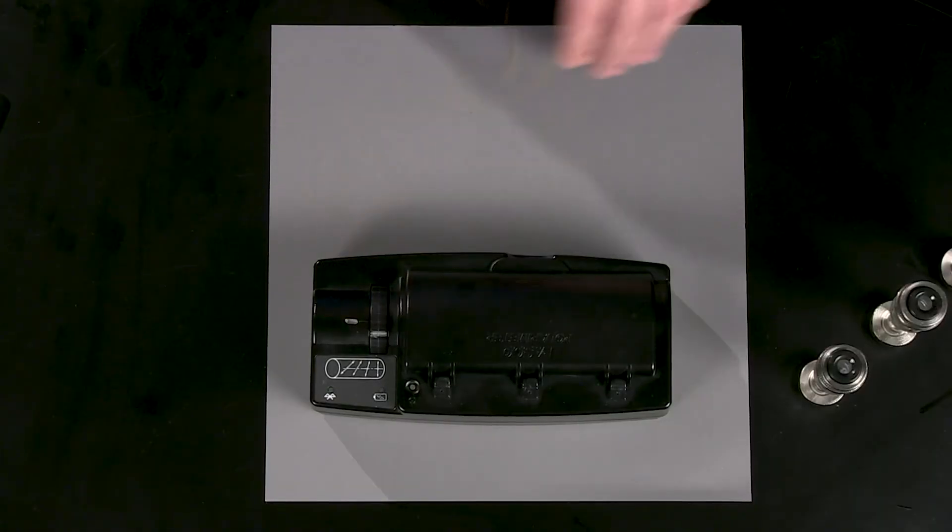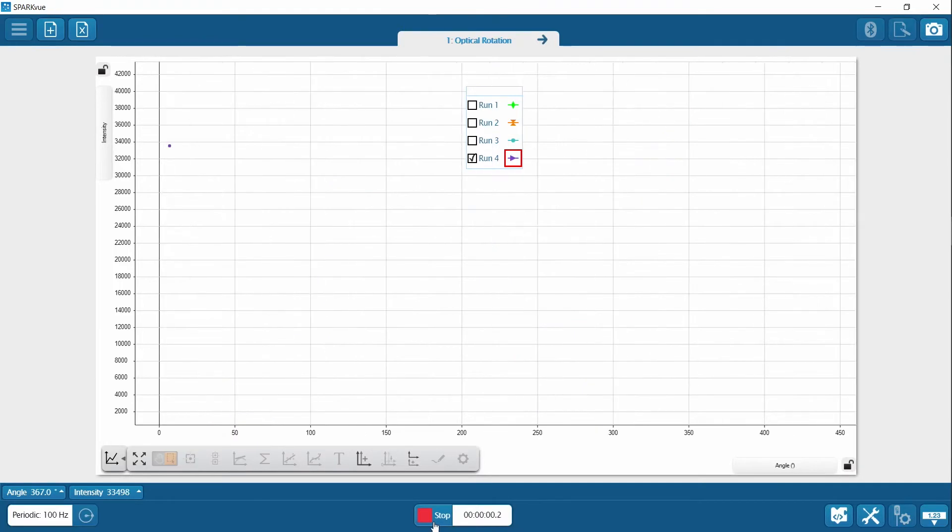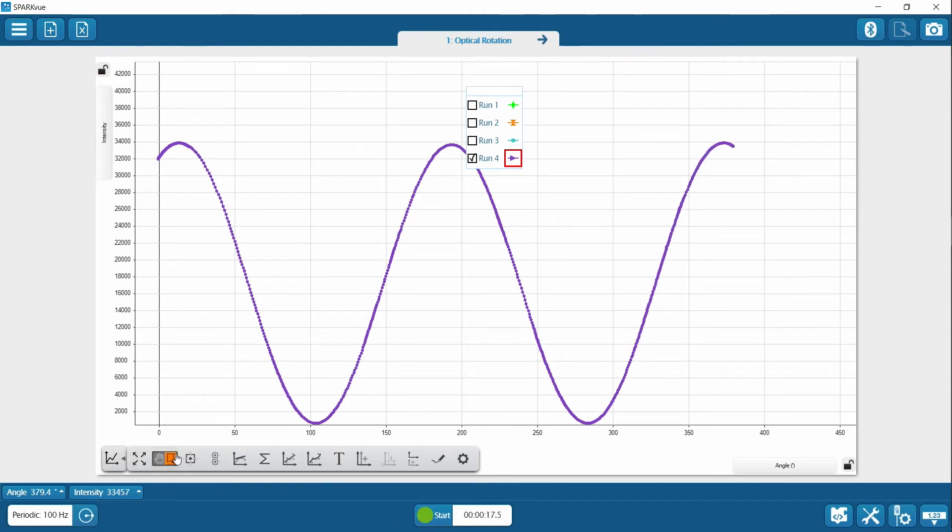Make sure this is just a little ahead of where we started so it starts closer to the axis. See where we started, and I'm going to roll that through at a nice even pace. If you go too fast, the peak may shift a little and not get caught by the best line of fit, so I usually just do it at a nice even pace.